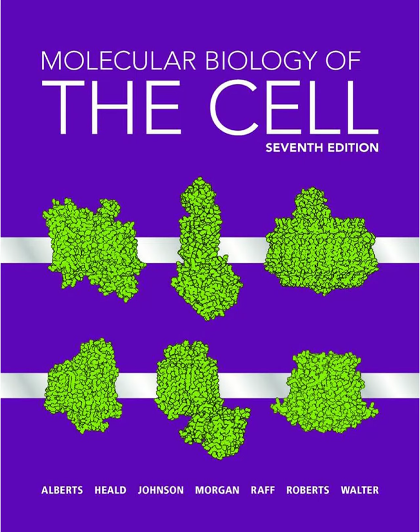Now, how have computers and digital cameras changed the game? Because our eyes have limits, right? Especially with dim light or subtle contrast. Oh, digital imaging has been transformative. It overcomes imperfections in the optics, yes, but more importantly, it blows past the limitations of the human eye. Our eyes aren't great in dim light, and we can't easily discern small brightness differences on a bright background.